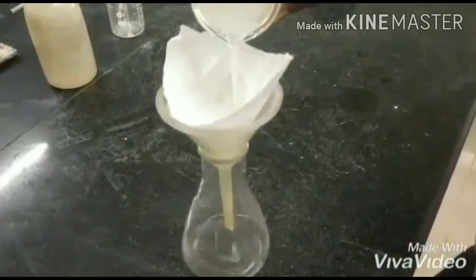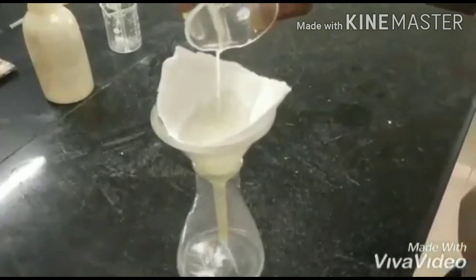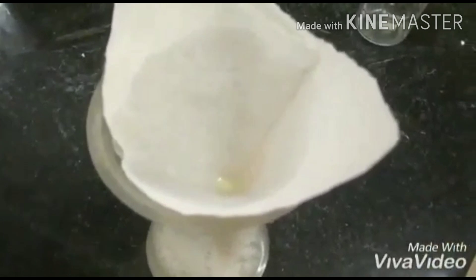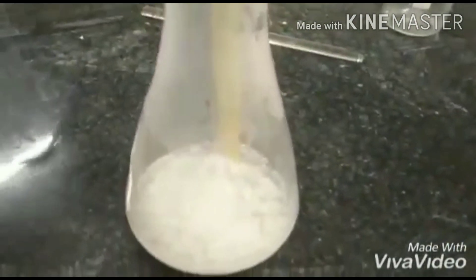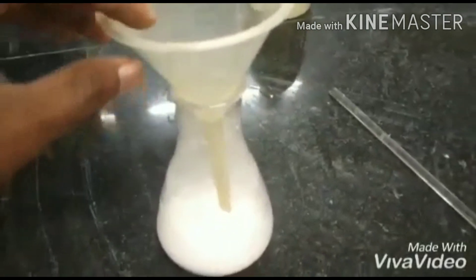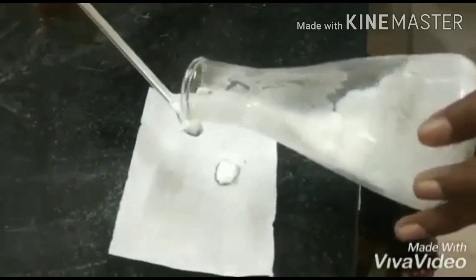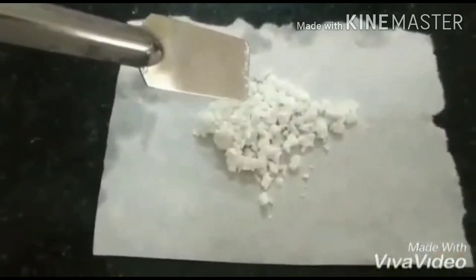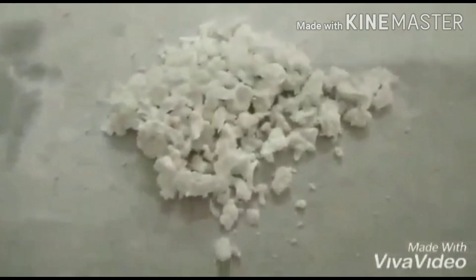The mixture is cooled and the crystals are filtered, then washed with several portions of water and ethanol. In this experiment, thiourea acts as a reducing agent, reducing copper from the +2 oxidation state to the +1 oxidation state.